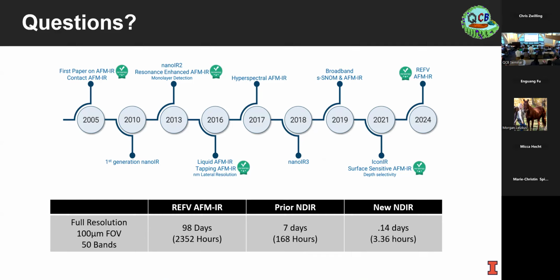Yeah, I mean that's a question for when we are able to use machine learning and stuff. But because the system produces a linear response to IR absorption, you can expect any signal to be proportional to the local concentration of the molecular species just under that tip. So until we get better methods to quantify these things, my goal is just to get the most pure FTIR quality signal at this nanoscale.